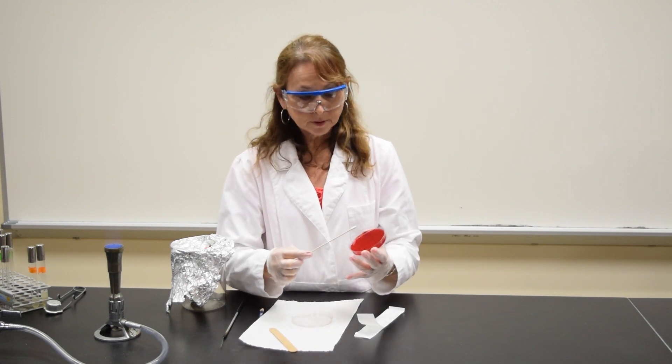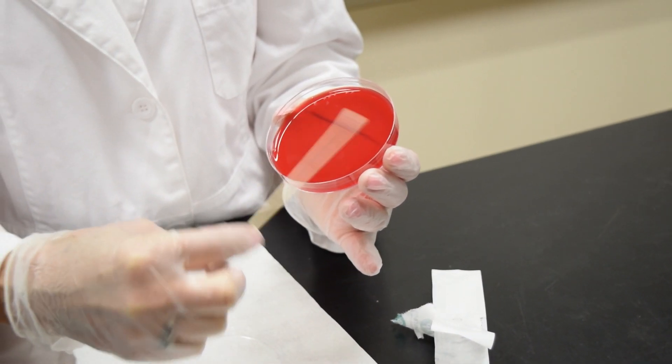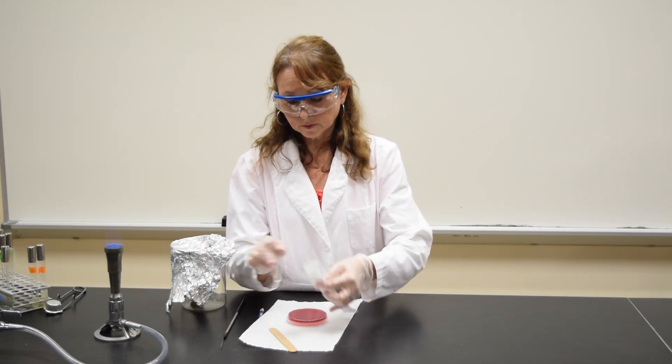You'll take the swab and you're going to swab the area above the letter T, which is area one. Dispose of the swab in the package.